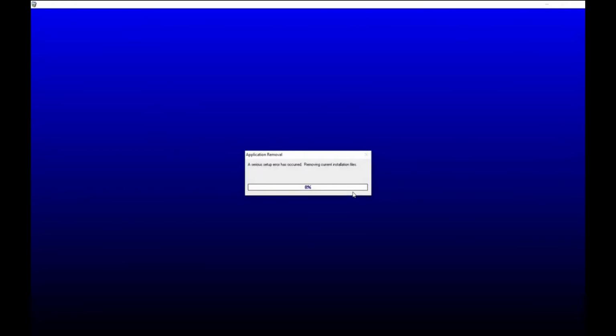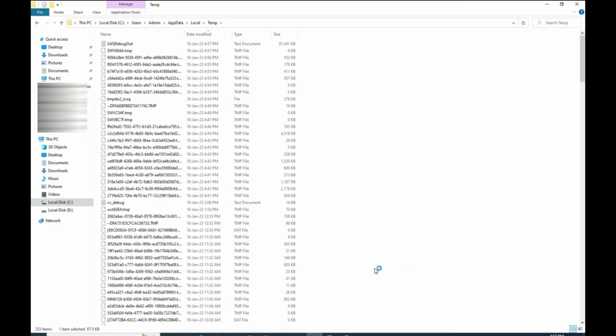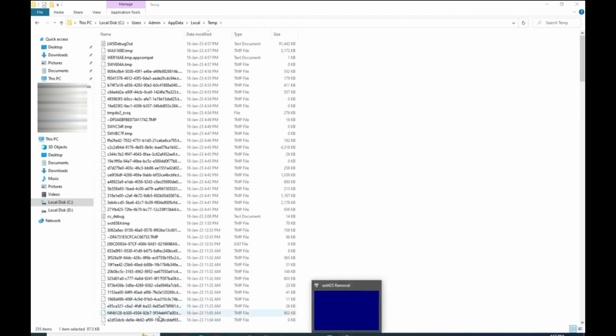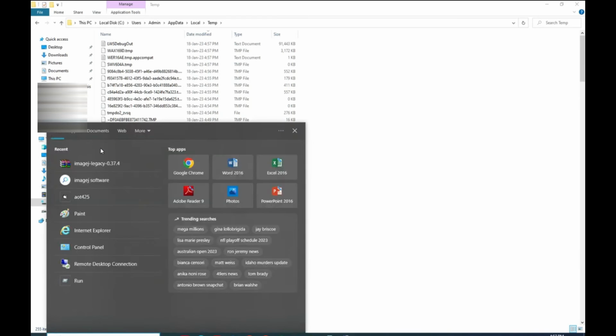Okay, and then it will show some error. Oh, you have to click OK always, and cut the option. You have to go back, stop this, and it is already installed in the.